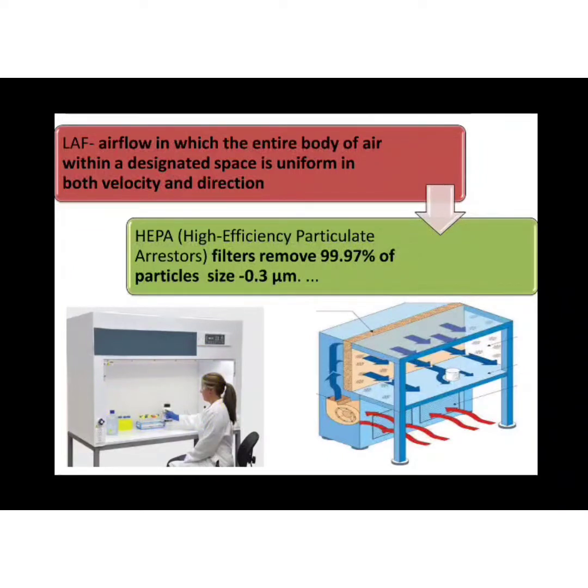Now, if you see in this diagram, the HEPA filters are fixed here. How is the working principle? It's basically working on suction force. Now, there will be atmospheric air outside. So, what happens here is, when we switch on the blower, the laminar airflow bench sucks in the atmospheric air, and then the blower will push the air that is sucked inside through the HEPA filters.